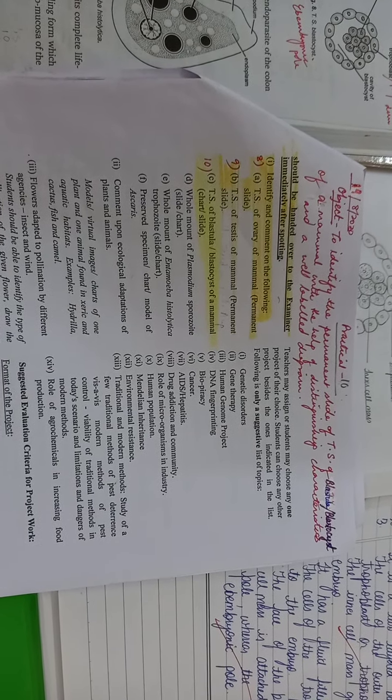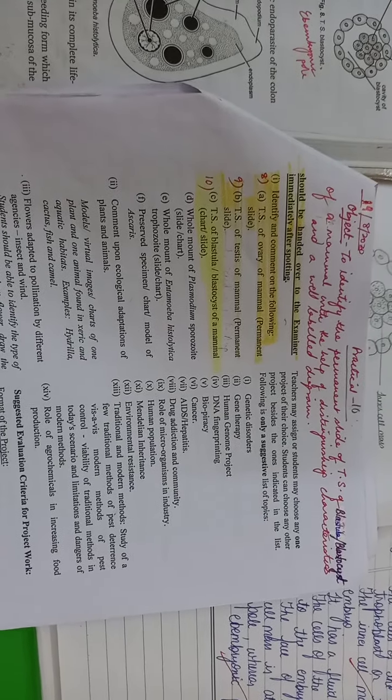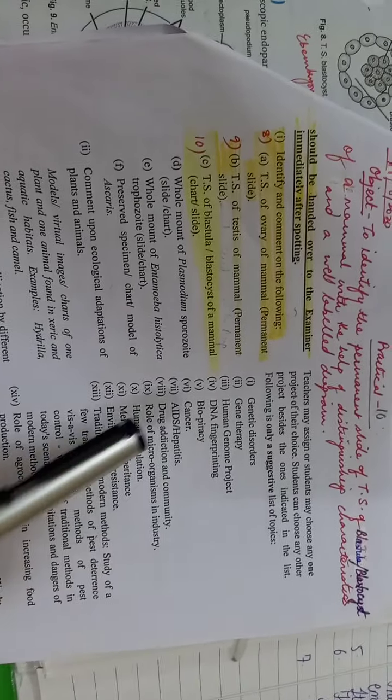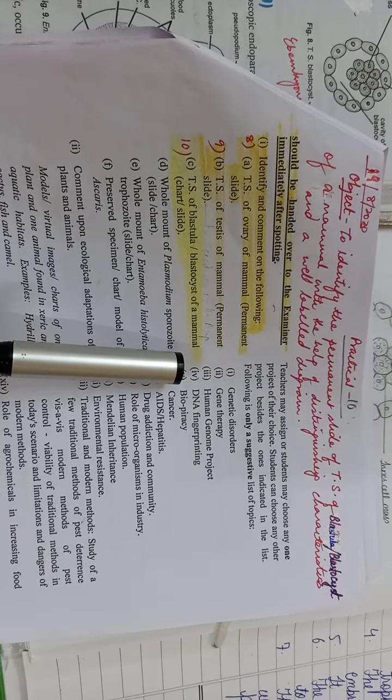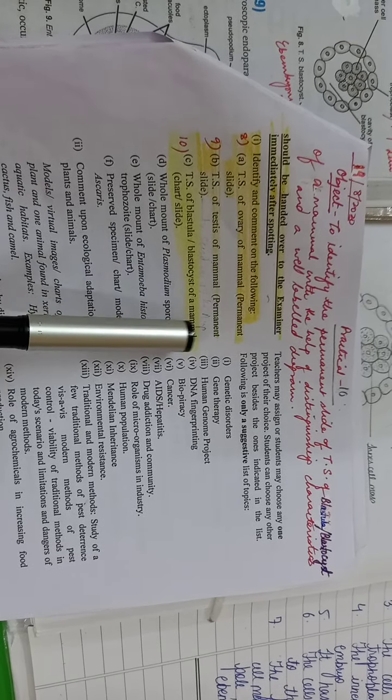Good evening, children. Welcome to another practical assignment for today. In today's practical, we will be doing TS of blastula or blastocyst of a mammal. This would be under the section D, that is spotting.